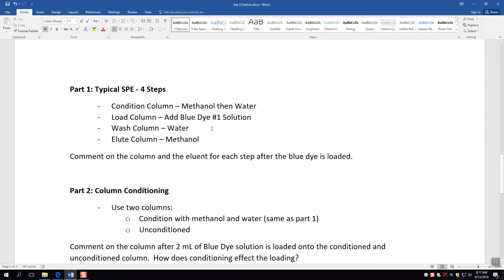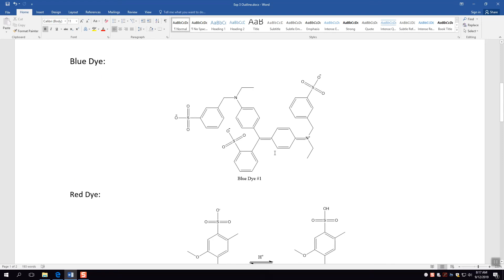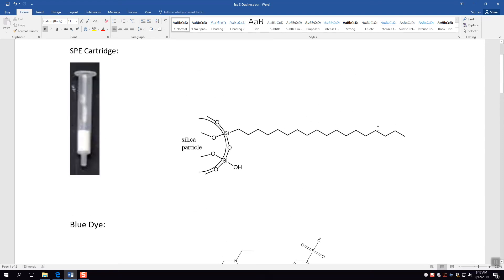We're then going to wash the column with water. In this particular case, that's probably unnecessary because the blue food coloring is already in water. However, if we were using something like a urine sample, we want to wash that out because there's naturally going to be some urine stuck in the column. We wash it out with water, and using water should not draw the blue food coloring away from this nonpolar substrate — there's enough nonpolar stuff in the blue food coloring that it should stick.